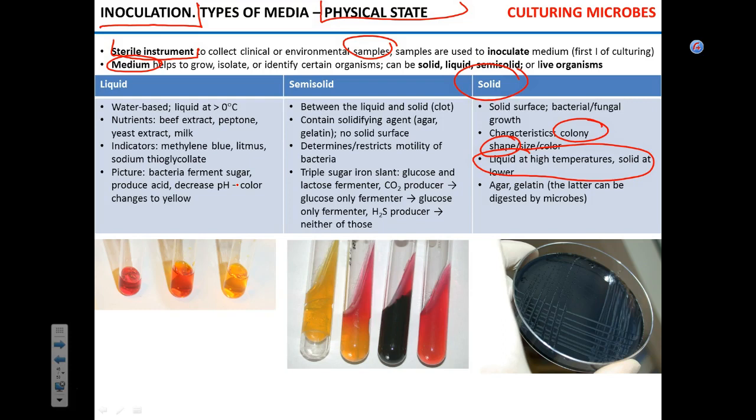Say you can add antibiotics to it. If you boil the agar with antibiotics, the antibiotics will all disassemble, decompose. But you can add them to agar that is cooler. It solidifies at about the temperature of 50 degrees Celsius. I don't remember what it is in Fahrenheit. Sorry, something like 120-something Fahrenheit.